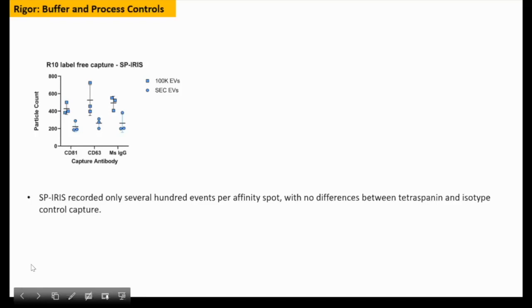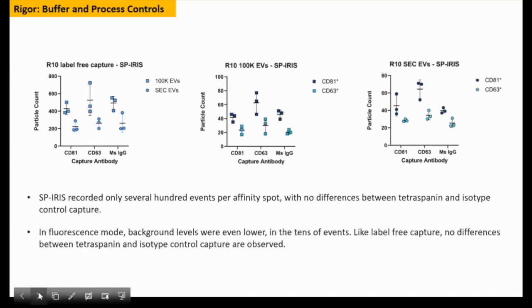And next, please. So in fluorescence mode, the background level is even lower, approximately tens of events.